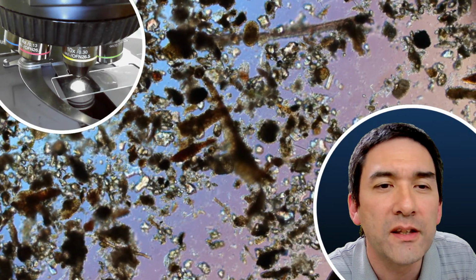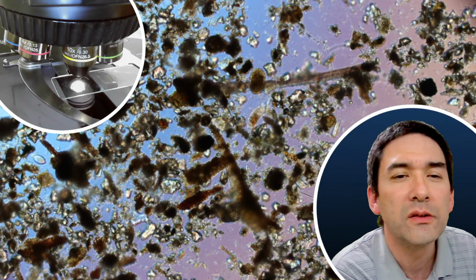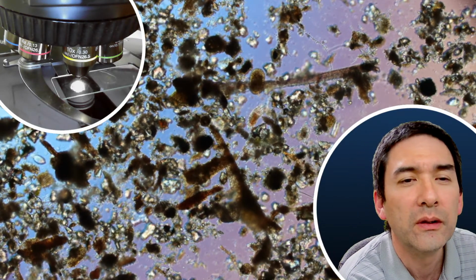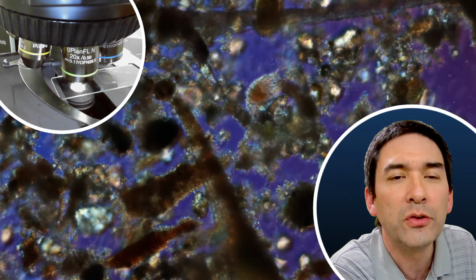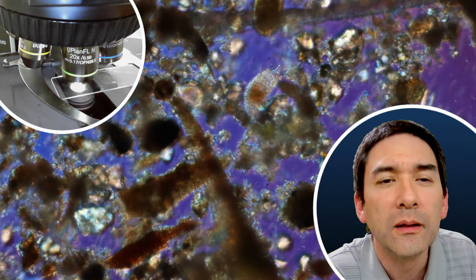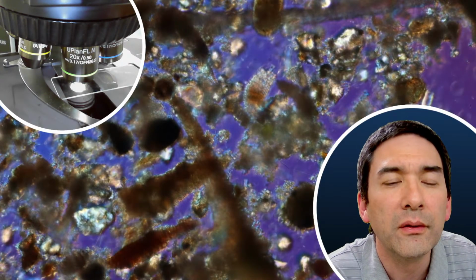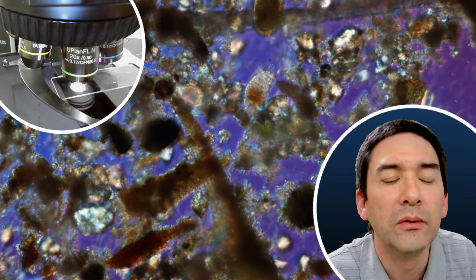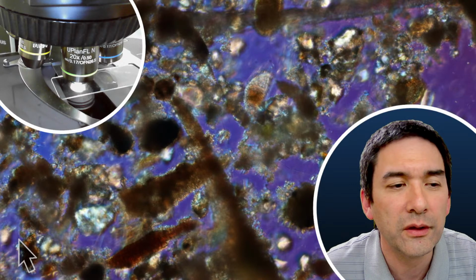Okay, so I've seen something here which is kind of slow moving. But I don't know. Let me have a look. I have to be very careful now because I'm not using a cover glass. But this could be one. I don't know. I'm going to use the arrow over here. Look, I've got this arrow.